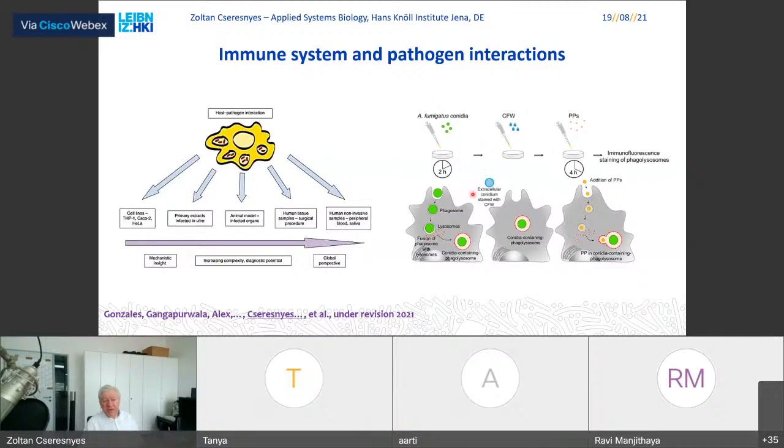And then we let the macrophages chase these fungal spores for a while, maybe 2 hours or so. These pathogens, these fungi, are usually labeled fluorescently so that we can actually see them on the microscope. The macrophages themselves are either labeled also fluorescently, for example, with an antibody, or not. And I will talk about this in detail during the lecture. On the other hand, counterstaining may also be necessary. I will give you details why. This is done in the next step.